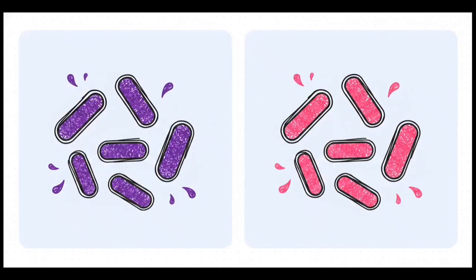And that stress test gives you the ultimate bacterial divide. Gram-positive bacteria, the ones with the thick, sturdy walls, they hold onto that purple dye for dear life, even through the alcohol wash. Gram-negative bacteria, though, thinner walls. They lose the purple dye and absorb that pink safranin counterstain instead. So remember, purple means thick wall, pink means thin wall.